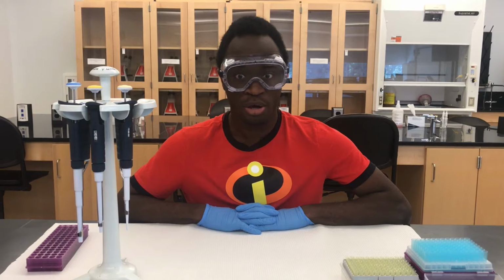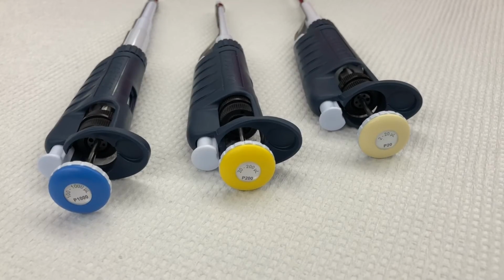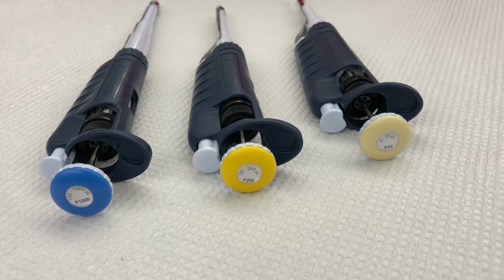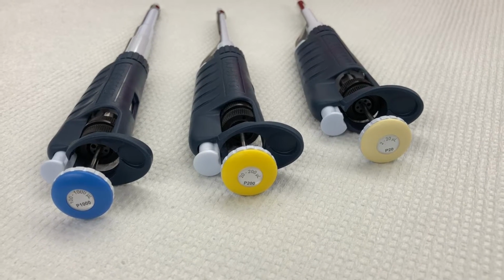Micropipettes are very expensive and delicate instruments costing $250 to $300 each. Therefore, proper handling is important to avoid damage. There are 3 different sizes of micropipettes you use in the lab. Each micropipette is capable of transferring different ranges of volumes. The maximum volume in microliters that can be transferred by a micropipette is indicated on the round button plunger.